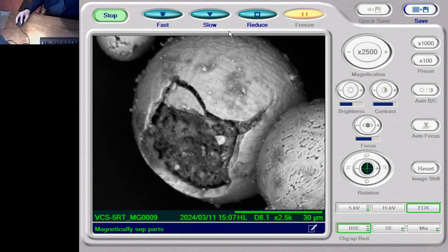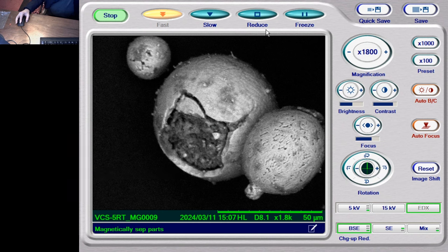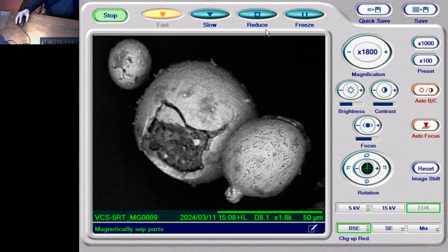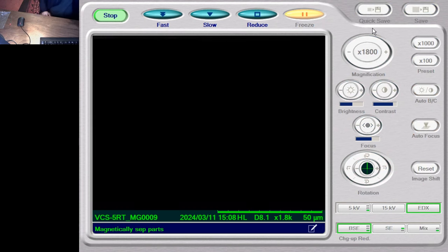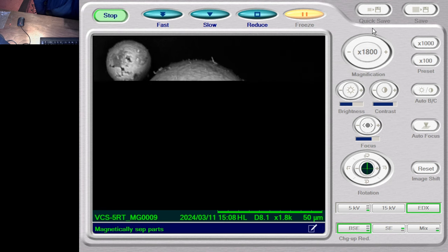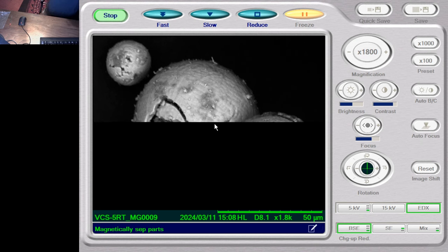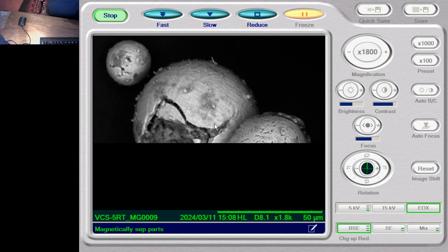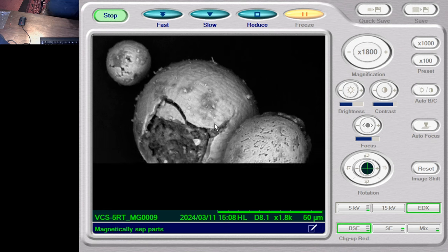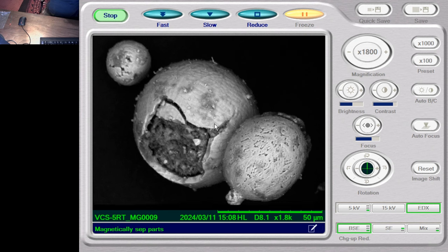And so we'll just come out of that a little bit so that we can see the whole thing. And maybe we'll come out so we see all of these three little items in the one shot. How about that? That's rather nice, isn't it? I'll take a shot of that. So the one that looks like the more pure one is this central one, which is hollow and has broken up and has revealed a mass of material inside, which I believe will be a range of elements, predominantly carbon.